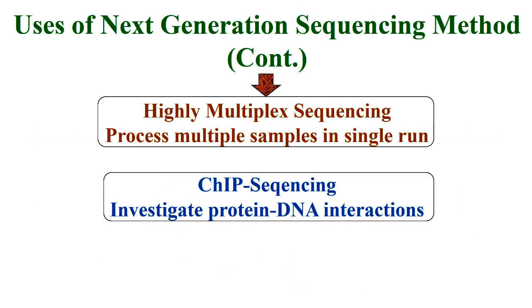And highly multiplex sequencing, to process multiple samples in a single run. And ChIP sequencing, to investigate protein-DNA interaction.